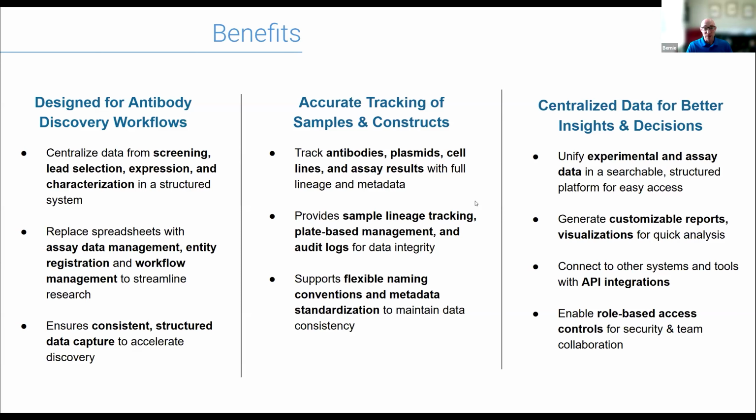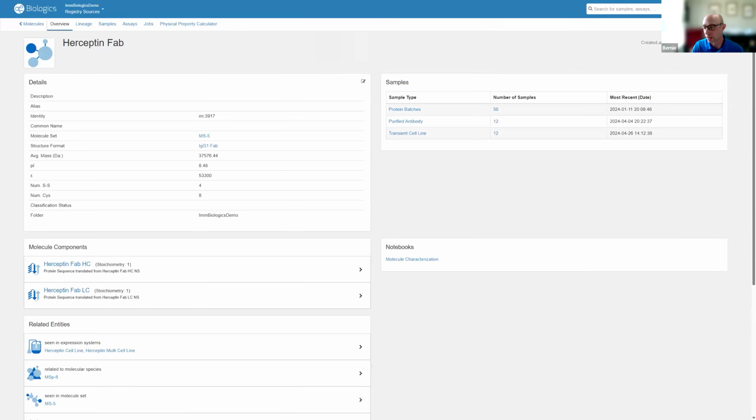Yeah. And with that, I told you short and sweet. I want to jump over and show you some of our application. So let me switch share here, and I'll show you some Biologics LIMS. Come on, Zoom. There it is. All right.